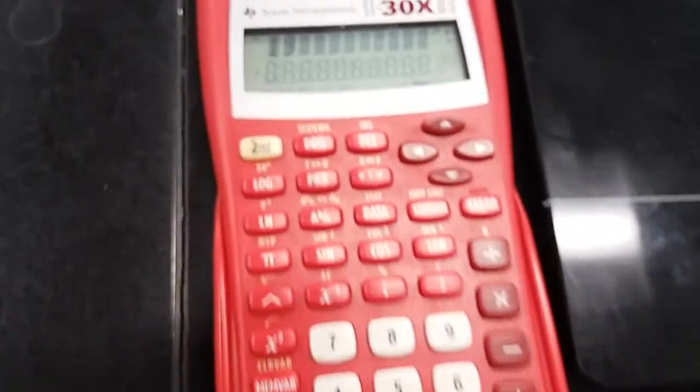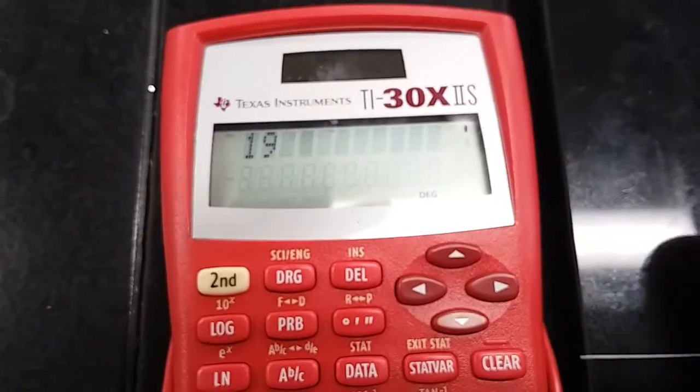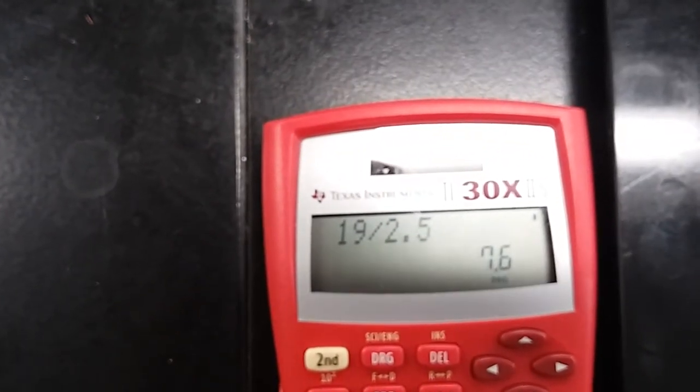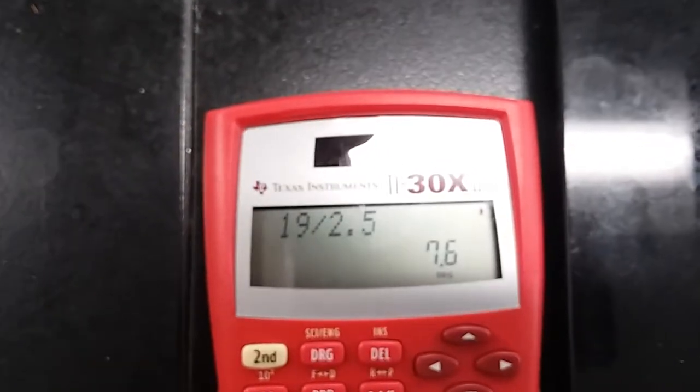So 32 and a half minus 30, that gives 2.5. So 19 divided by 2.5 gives us 7.6 grams per milliliter. That is the exact displacement of this object.